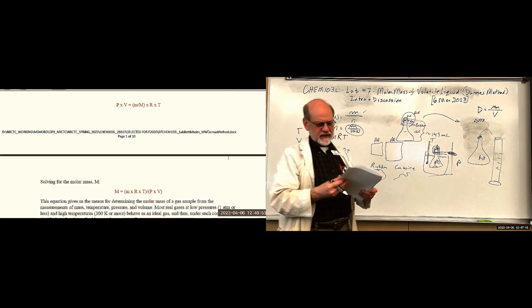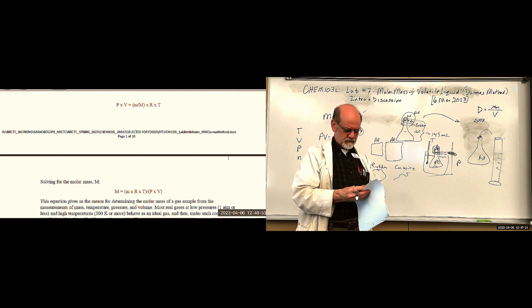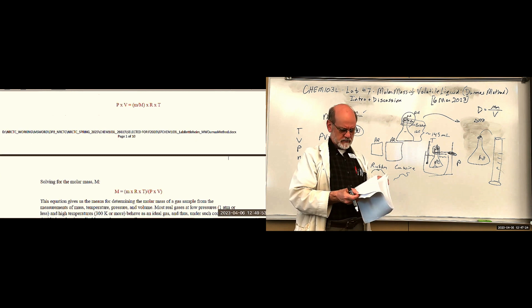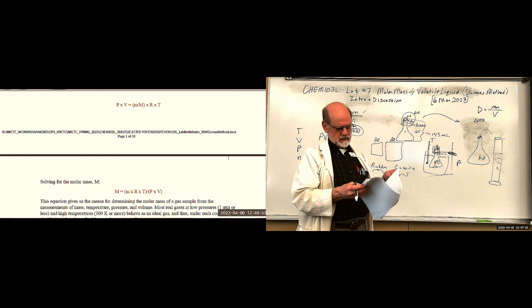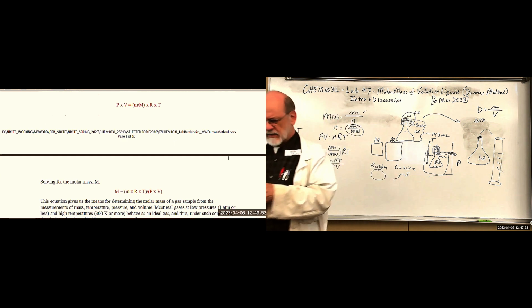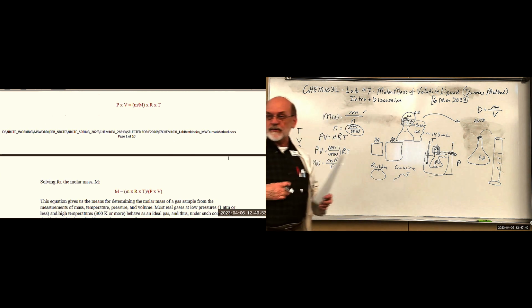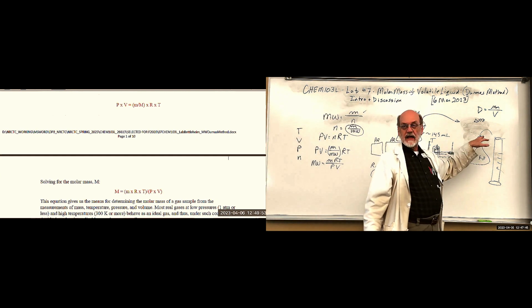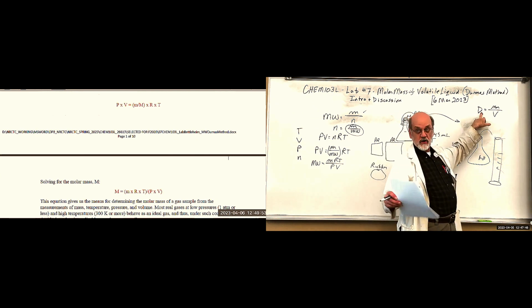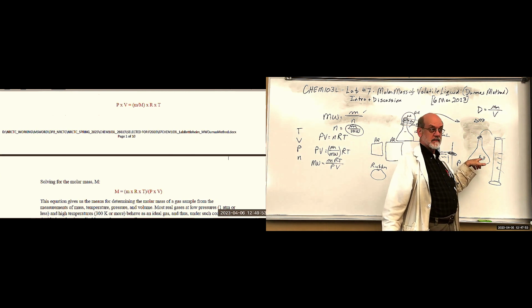Okay, and I think there's a chart in the method with the density of water at different temperatures. Could be. Let me see if it's still there. Oh, this is my key. It may not have it in this one. It's in yours. Yeah, that blue. Yeah, that's it. So all you need is the exact temperature of the water, and you can get the density from that chart.